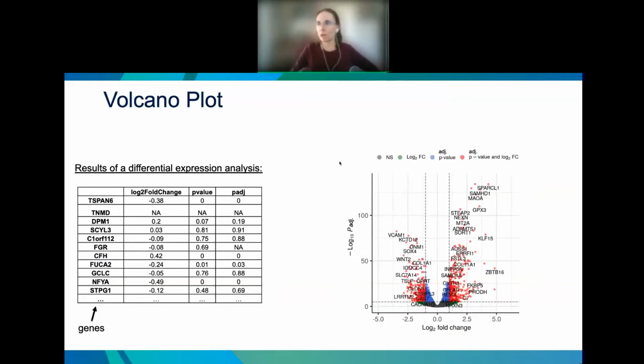All right. So that was heat maps. The second visualization I wanted to go over here are volcano plots. So with heat maps, we were just looking at count data and mapping it onto a color range. Yes, after scaling, but we didn't do any statistics like log fold change, p-value, etc. A volcano plot is a way specifically to look at the statistics in your data through a visualization.